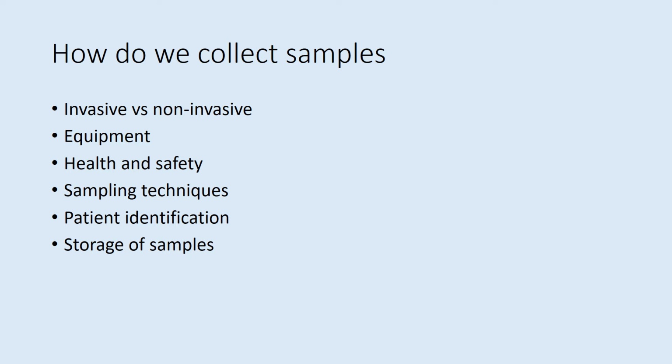And then we need to make sure that they are stored correctly. If we are going to be running them as an in-house test, then you can run it immediately. The sooner you run it, the better. If it is going to be sent to an external laboratory for testing, then that is something that we will be covering later on in the course, because it is one of the learning outcomes, so we can make sure that we store it and package it appropriately in order to be sent to an external lab and still be of diagnostic quality. So that is the main thing. We need to make sure that we have that diagnostic.